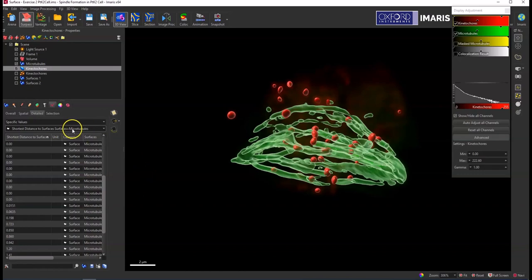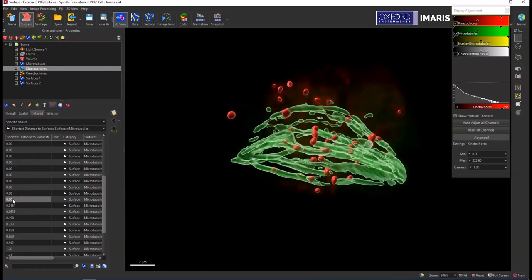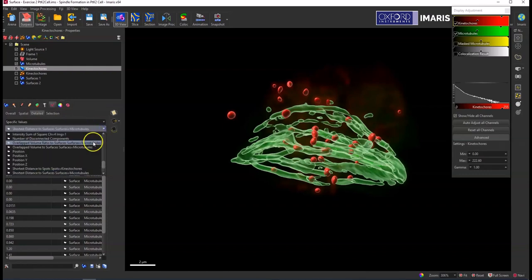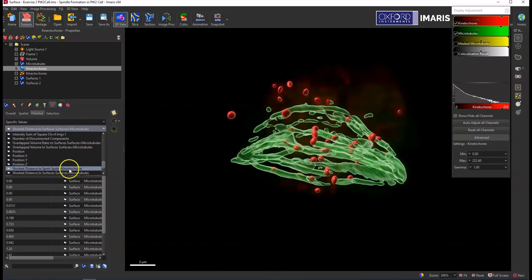In this situation it's a microtubule surface, so just remember zero microns or less means that it's touching or within the surface that it's being compared to. You can also do this with a spots object here. You can see that there's a previously created spots object for the kinetochores also.